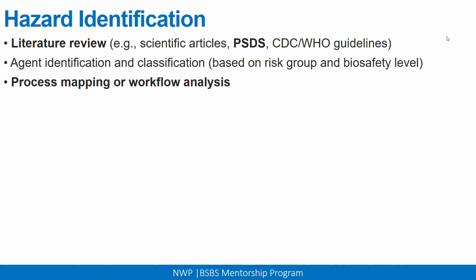Then you look at the gaps in the workflow or in the map. Where in the workflow can you get exposed to these particular biological agents that you're testing? Then through that, you can now close those gaps, because if you close those gaps, it means that you would have reduced the risk of exposure through those gaps that you would have identified in the workflow.